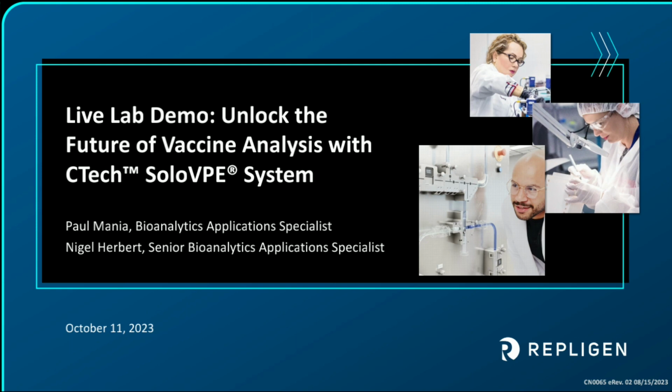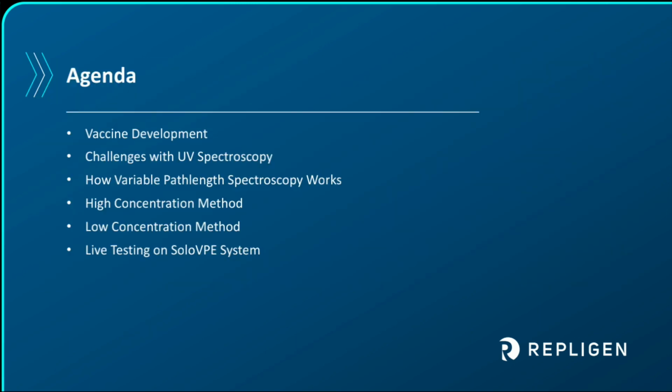As mentioned before, we will introduce the CTech SoloVPE system, its benefits, how it works versus traditional UV, and I'll also introduce some applications as well. At the end of the webinar, we will be doing a Q&A session as well. So again, this is just a brief agenda.